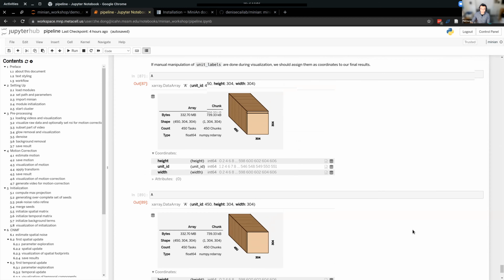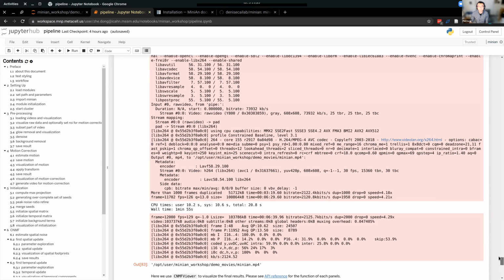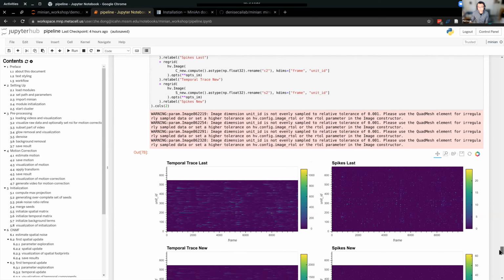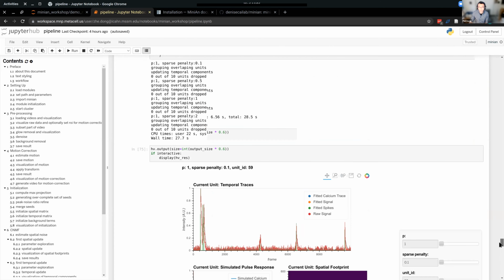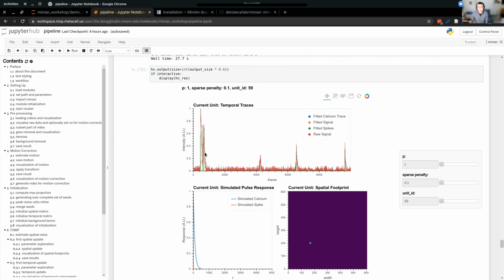Right. Since we're on this, I'm going to quickly tell you my experience. Stuff like this will be saved because it's a static visualization, literally just a plot. I think it's possible to be saved in a notebook. Stuff like this will not be saved because it's computed on the fly, dynamically generated for you. So it either will not be saved or a crappy snapshot of it will be saved in the notebook.